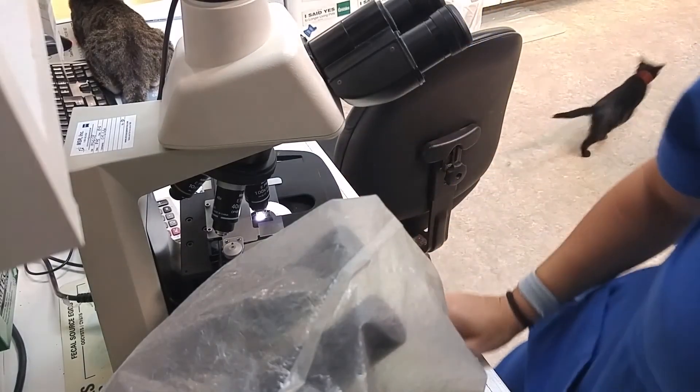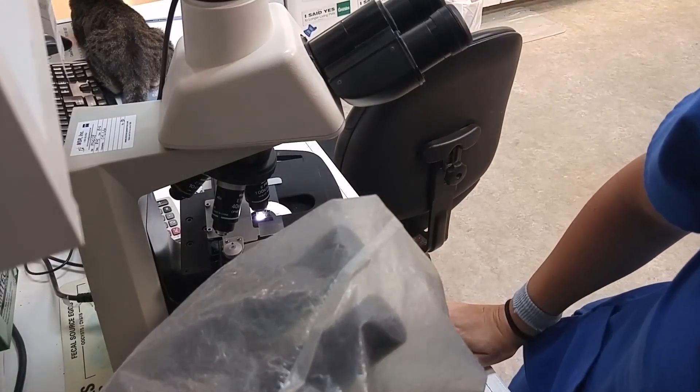So far I'm not seeing any yeast. Sometimes we'll see budding yeast, but so far I'm not seeing any of that. That's about all you look for on your slide.